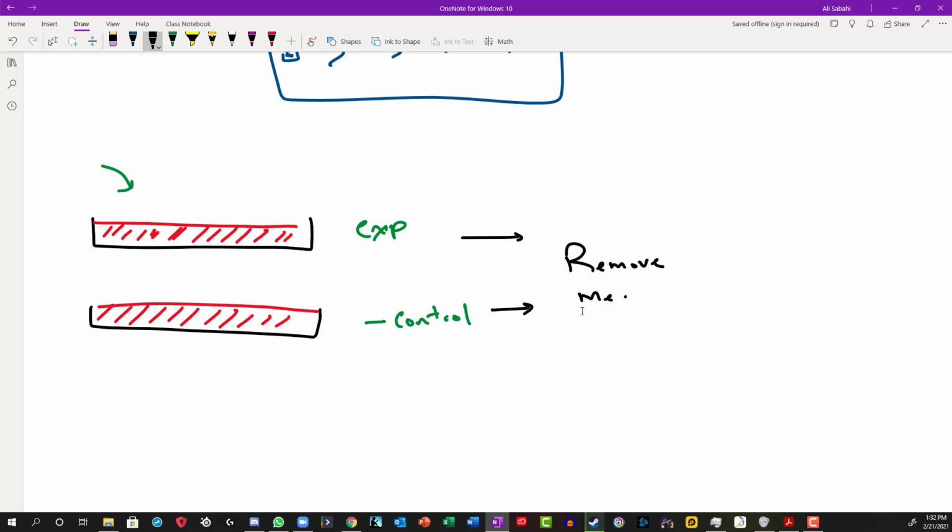That is the liquid that is on top of the cells. You remove the media and you clean to make sure all media is removed by washing the monolayer of cells, remembering that the cells are all stuck to the bottom, right? These are the type of cells that we're going to say bind to the bottom of the plate.